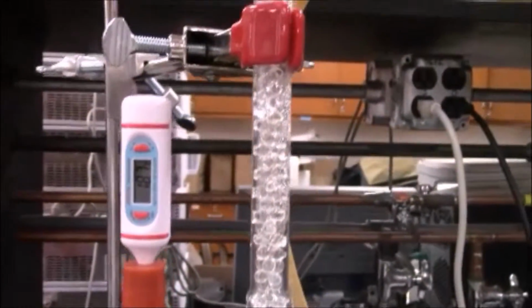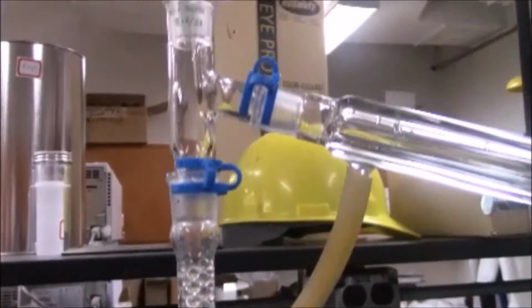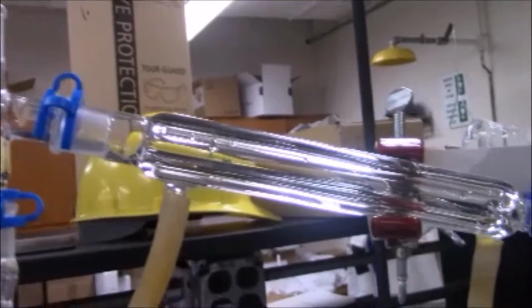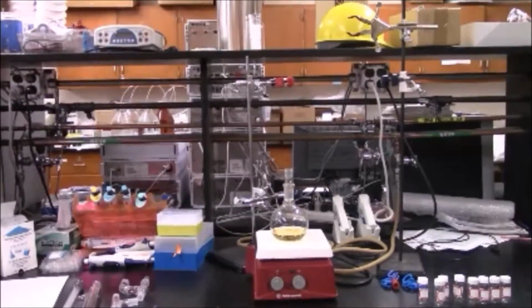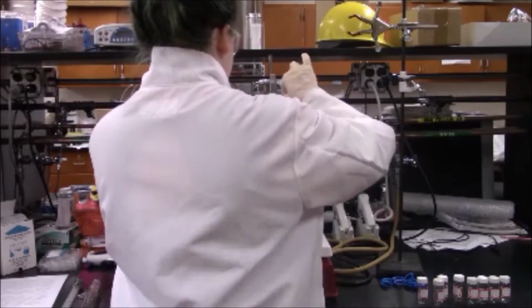Distillation will be accomplished by boiling the solution and allowing the vapor to be processed through a column containing glass beads. As the vapor rises through the column, some of it condenses as a liquid and flows down by gravity to the bottom flask. The contact between rising vapor and downward flowing liquid has the effect of enriching the vapor in ethanol on its way up the column and enriching the downward flowing liquid in water. The ethanol containing vapor will then travel through a water-jacketed column, where it will condense and drip into a vial.